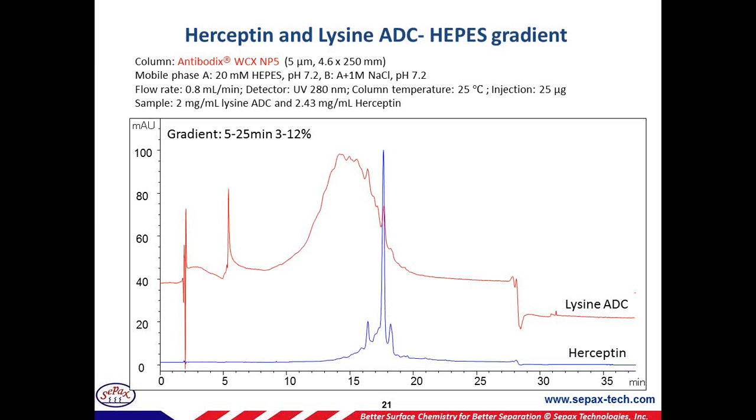But in this case, we still can see the unconjugated mAb, and further method development can be done to further separate the peaks of the bigger mountain here. I haven't seen a lot of positive literature about lysine conjugate separation on IEX, but we do have customers using that to monitor their molecules. And I think Immunogen had a presentation on lysine conjugates with cation exchange separation. They do resolve their peaks much better.